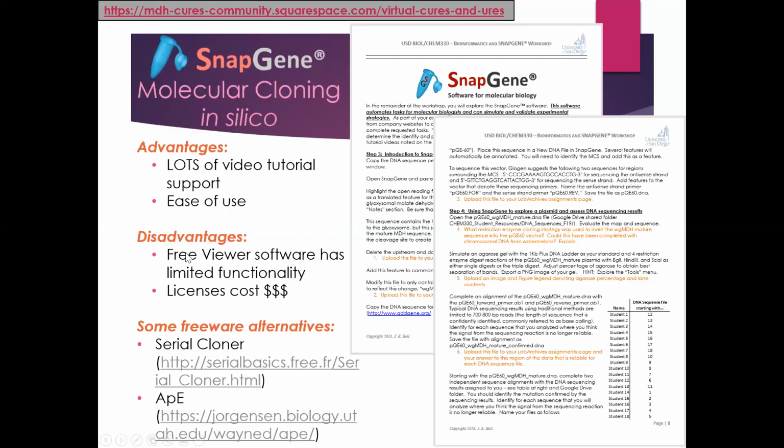Disadvantages: they do have a free viewer. You can download it and use it freely to look at different aspects. It does have some limited functionality in the free version though, so you can't do all the stuff in silico and exploring molecular biology that you could if you had the paid version. And of course, licenses cost money. So I emailed my chair last night and asked, like, how much did we spend per license last semester on that? Just to give you guys an idea.